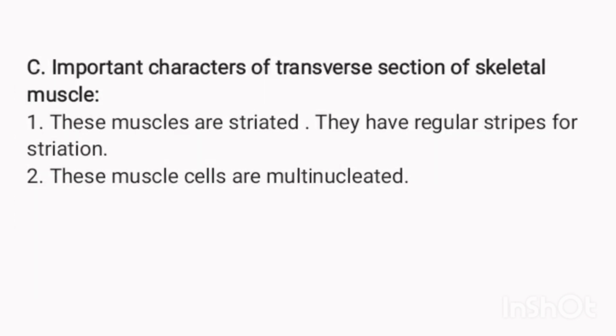C. Important characters of transverse section of skeletal muscle. 1. These muscles are striated. They have regular stripes for striation. 2. These muscle cells are multinucleated.